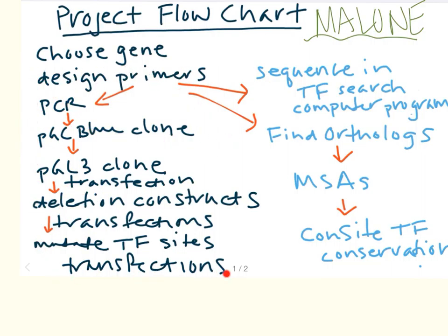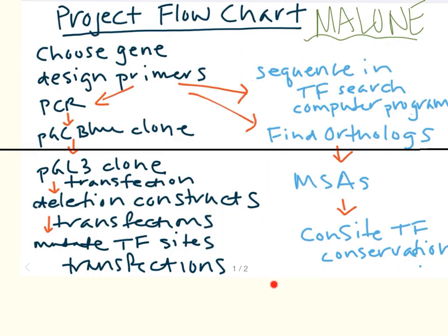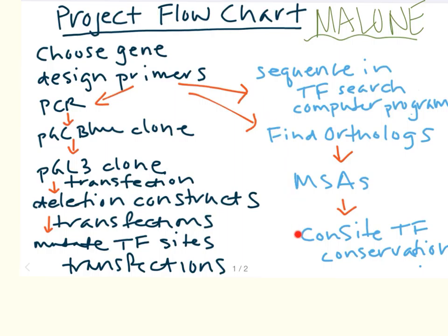These are wet lab, these are computer lab. So there's always something to do while you're running a gel, waiting for PCR, waiting for cells to grow up, or what have you. So let's go down this row first, and then we'll come back over here. But as we mentioned again, these should be done simultaneously. We do not need to wait to get down this row in order to start down this row.